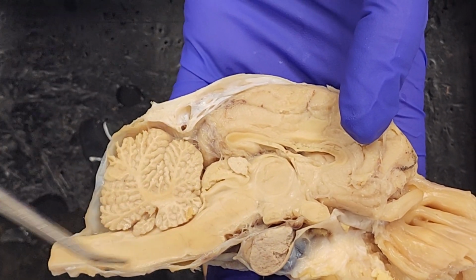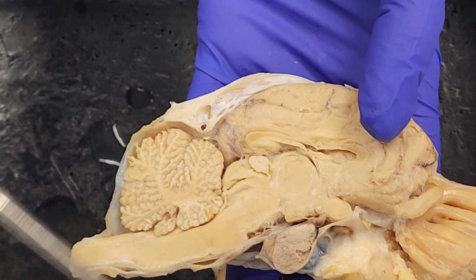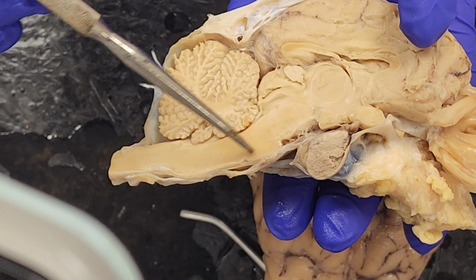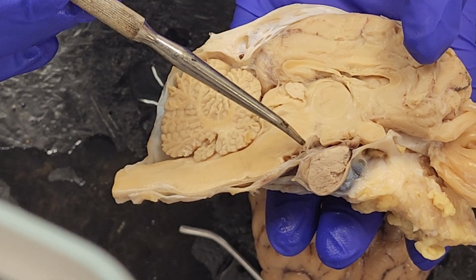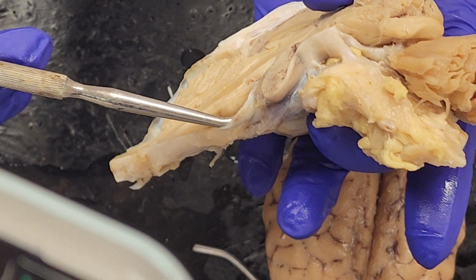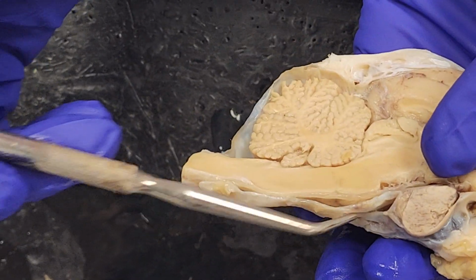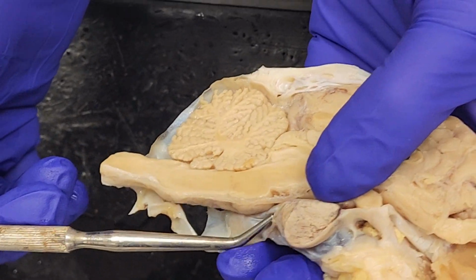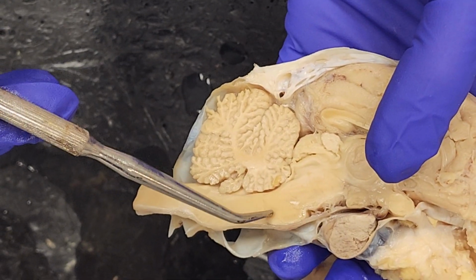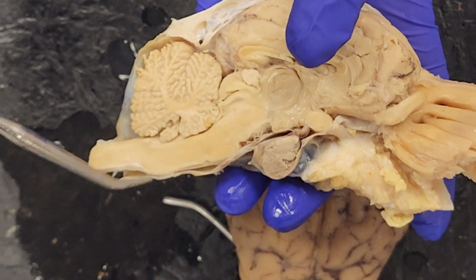You get into this section, this is all the brainstem. You have the midbrain that kind of comes down like this. It's not very easy to tell really where it stops, but this is the midbrain. This part is the pons, which you see as this ridge underneath, right? If I reflect that back, see that's the pons area, and it correlates to that. And then this would be the medulla oblongata, this bottom part.